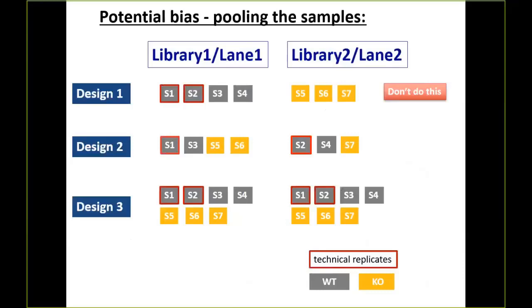That tends to actually be a very difficult question and is very application dependent. Just because the number of reads I need for a microbiome sample and the number of reads I would want for, say, an exome sample, those can vary by like 2 orders of magnitude. Microbiome sample, I'm usually fine with thousands and thousands of reads. An exome sample, I'm looking at millions and millions of reads.